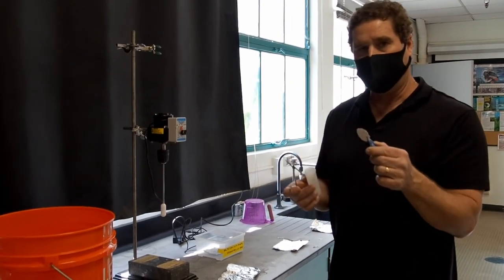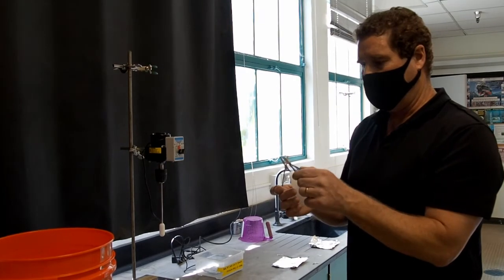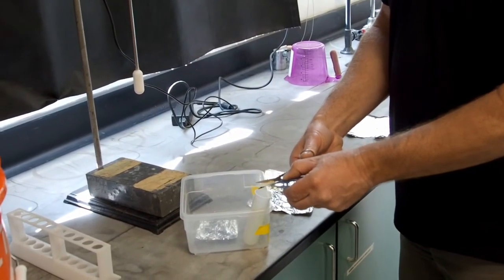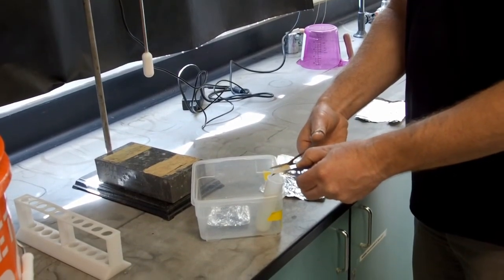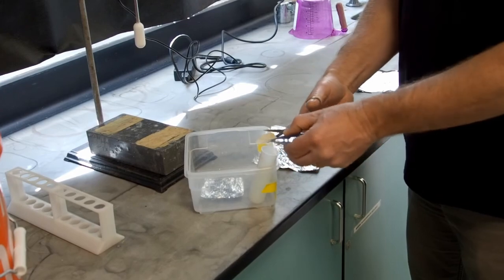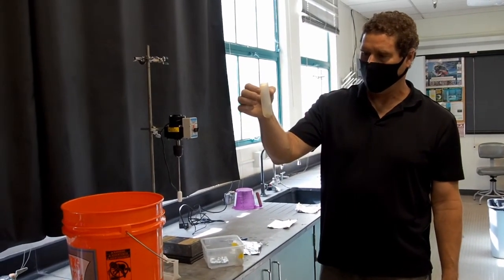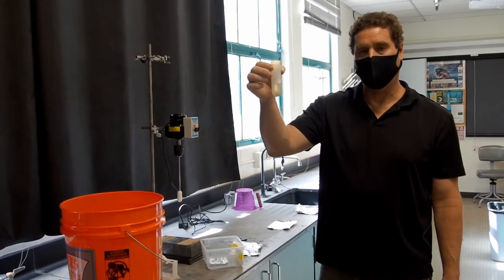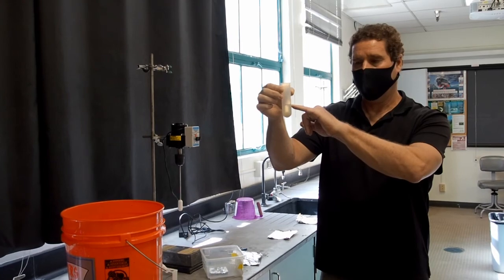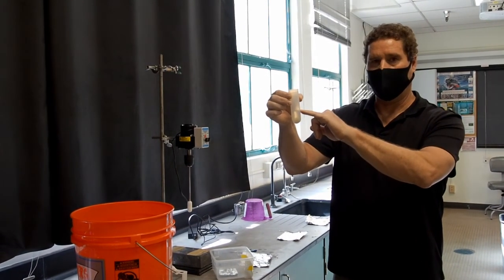So the first step is to try to cut this into tiny little bits so that it's as easy to dissolve as possible. So our first step is to take this filter and just use your scissors to cut this into very, very small pieces that go into this tube. So here's our filter, all nice and cut up into small bits in this tube, and I'll put some acetone in the tube, which is going to help start to dissolve away the paper and retain the chlorophyll.